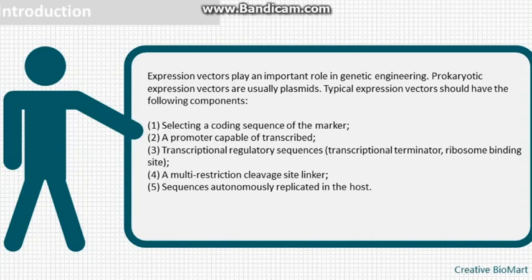1. A selectable marker coding sequence. 2. A promoter capable of transcription. 3. Transcriptional regulatory sequences, transcriptional terminator, ribosome binding site. 4. A multiple restriction cleavage site linker. 5. Sequences autonomously replicated in the host.